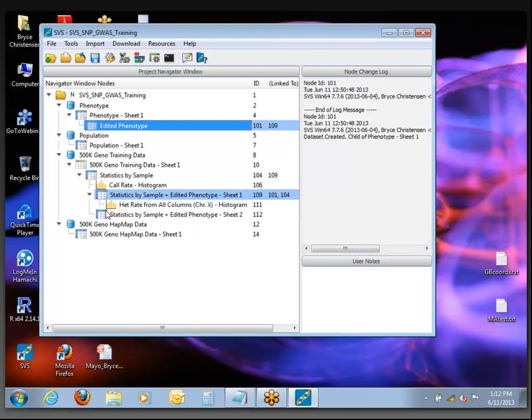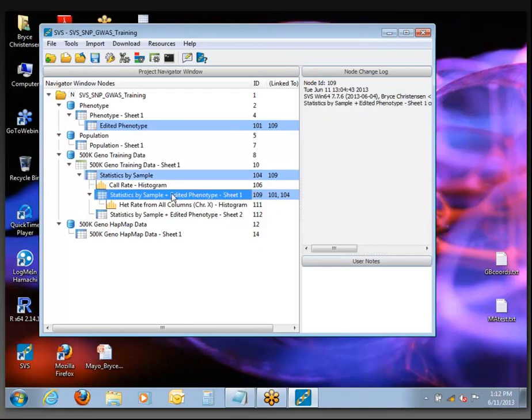There are some strategies you can use to avoid creating so many sheets. For example, we have this one called 'statistics by sample plus edited phenotype sheet 1' — that's what we created when we did the merge between those two sheets. That's why you see them highlighted when I click this one — it's telling me it is linked to sheets 101 and 104.